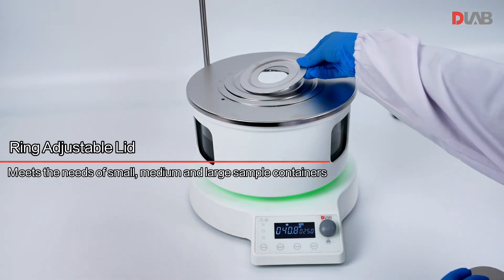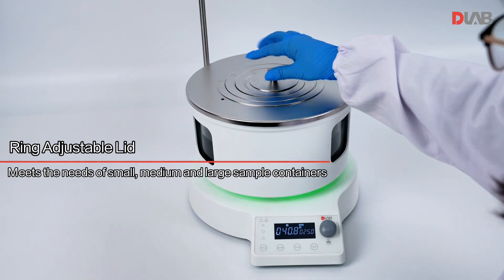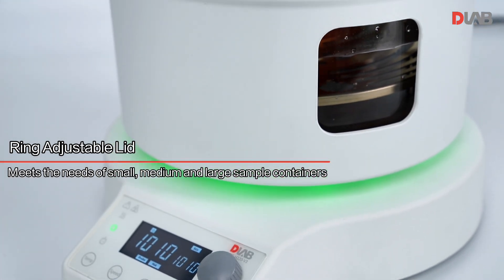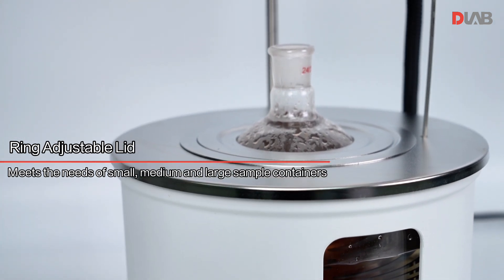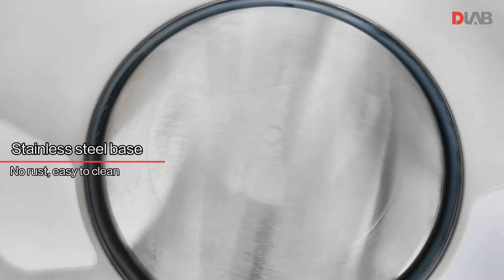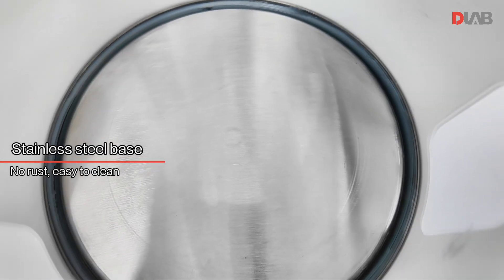Stainless steel base — no rust and easy to clean.